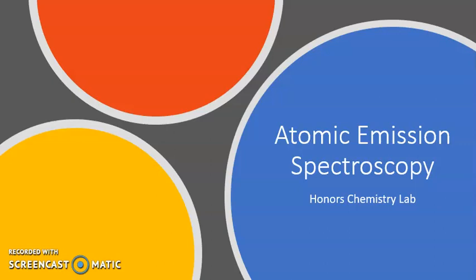Welcome to the Makeup for the Atomic Emission Spectroscopy Lab. I just want to take a couple minutes and review the process of electron excitation, since that's exactly what you're going to be seeing during the course of this lab.